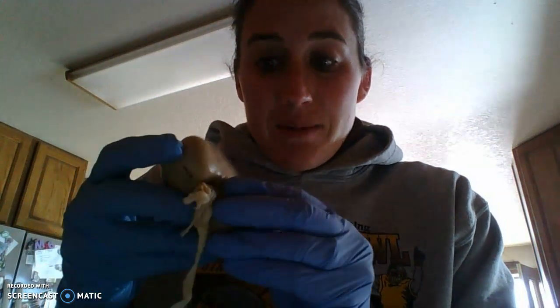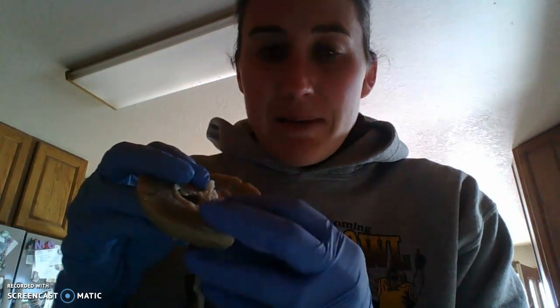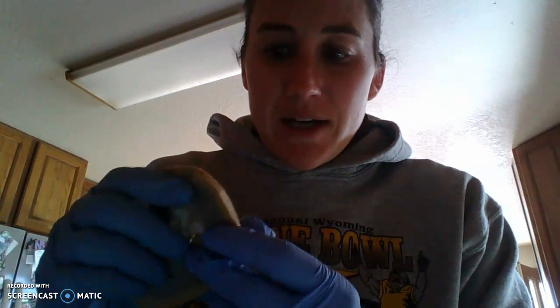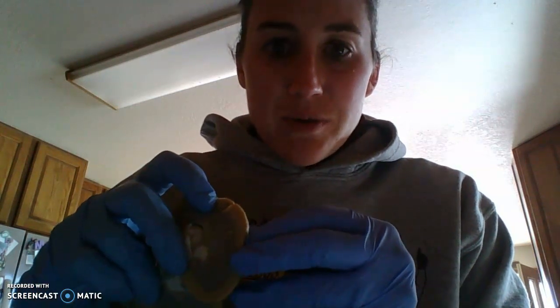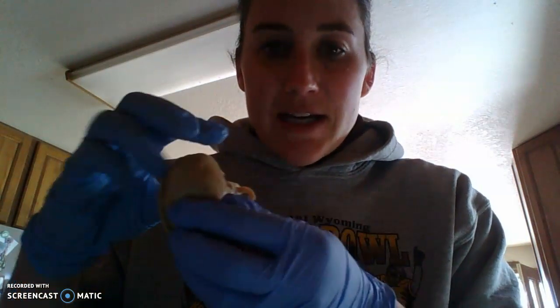So I didn't expect this kidney to be as dense, but it really is super dense, and it would be really neat to look at some of the kidney under the microscope to see the units within it, because I know it gets extremely complex. But cool dissection, and that kind of wraps it up for me.